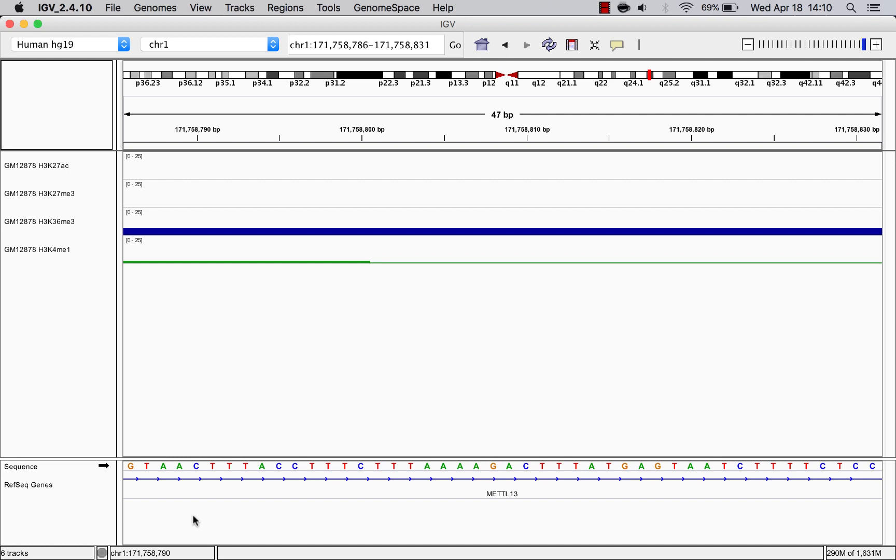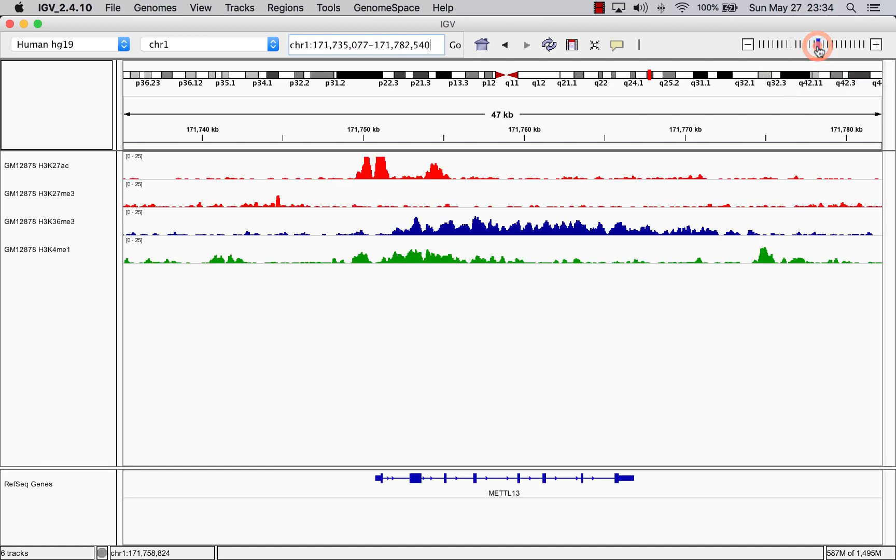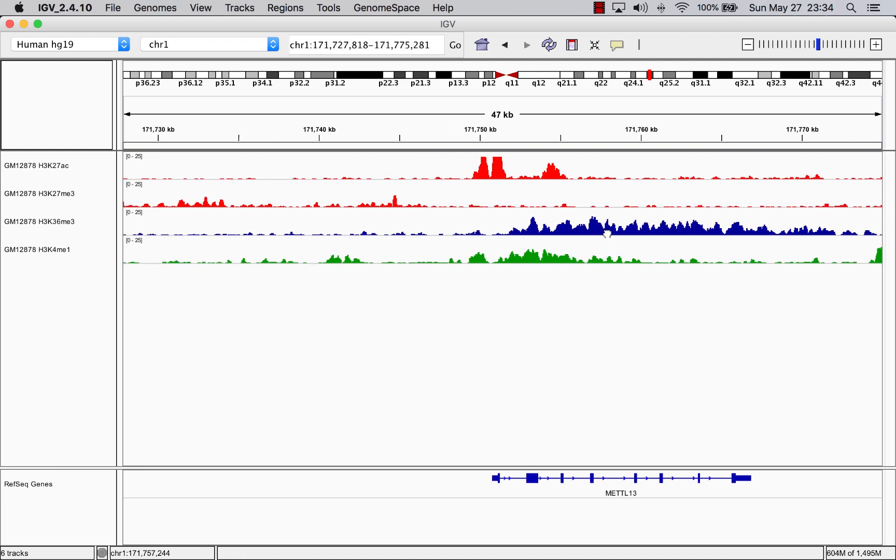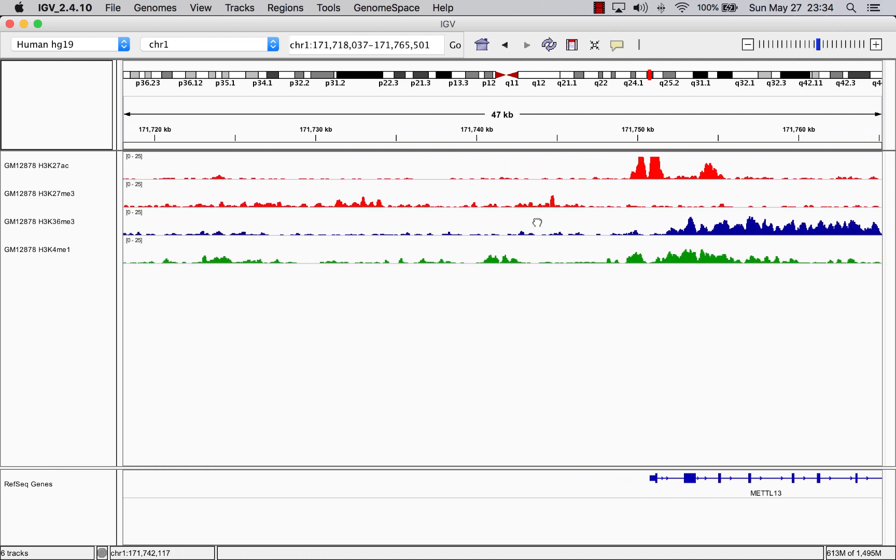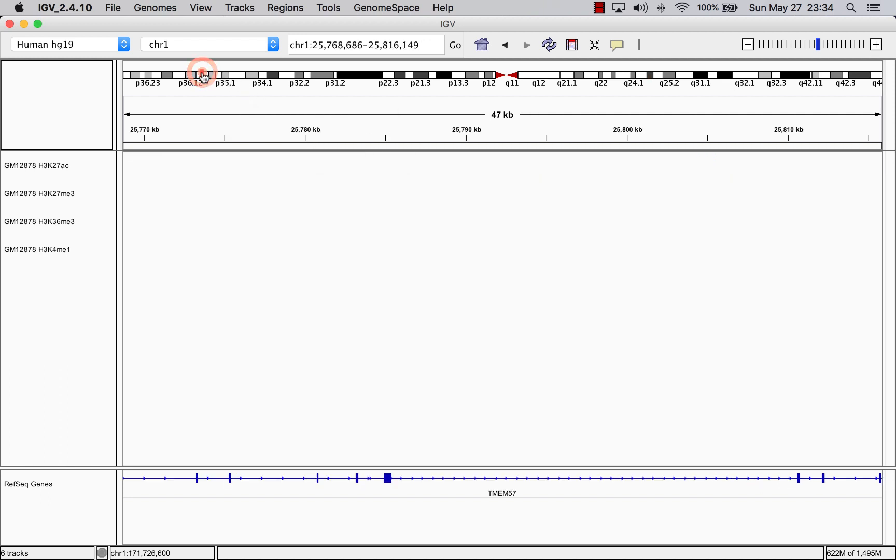If you want to jump to a different zoom level, you can click on that level in the zoom tool. If you want to stay at this zoom level and see a different place in the chromosome, you can drag the data tracks or single click somewhere in the cytoband.